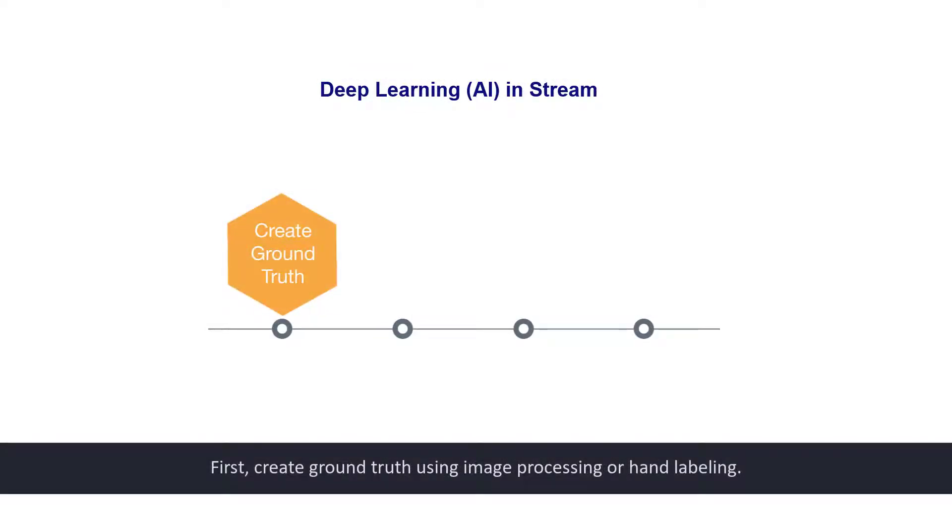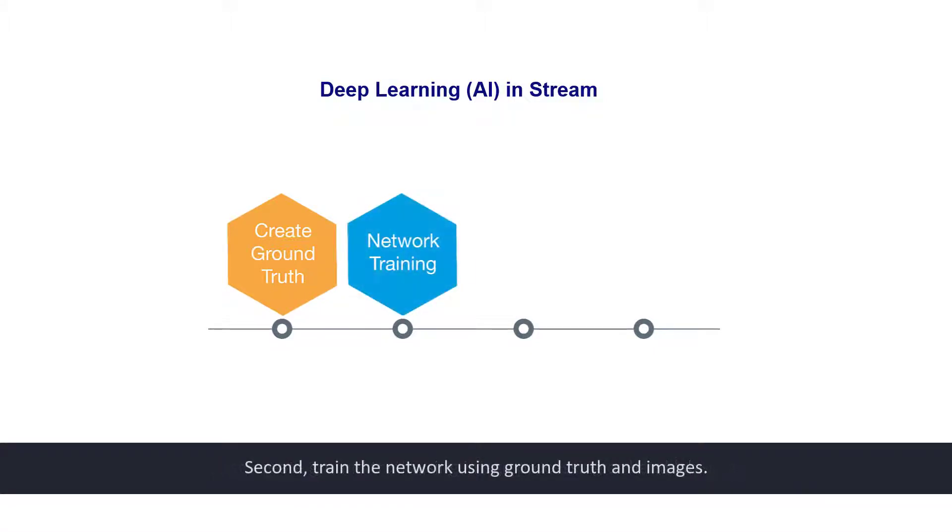First, create ground truth using image processing or hand labeling. Second, train the network using ground truth and images.